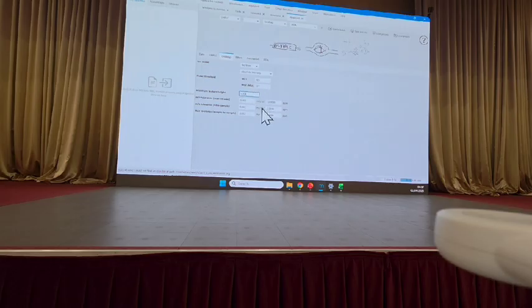We now want to tell the software what signal is meaningful. So this setting right here is the intensity required to say, hey, this signal is actually coming from something we're interested in, some actual meaningful feature.